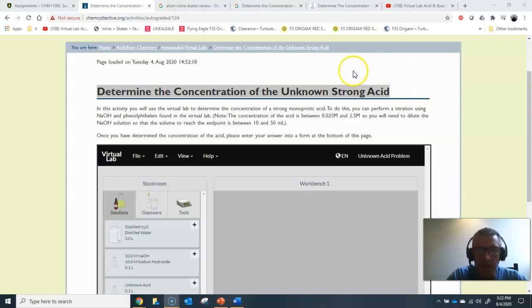Hey, this is Dr. B here, and I would like to give you a little bit of assistance for performing a titration using the lab virtual system in the ChemCollective.